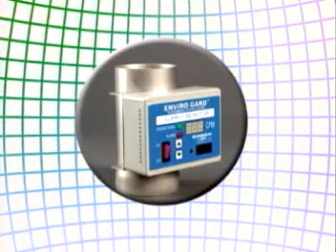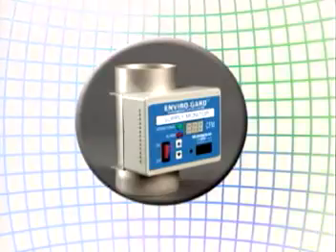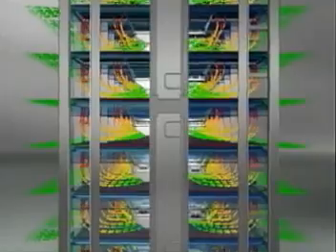EnviroGuard monitor control A units allow you to connect your micro isolator racks directly with your facility HVAC air system to maintain balanced airflow for each and every rack and individual cages.